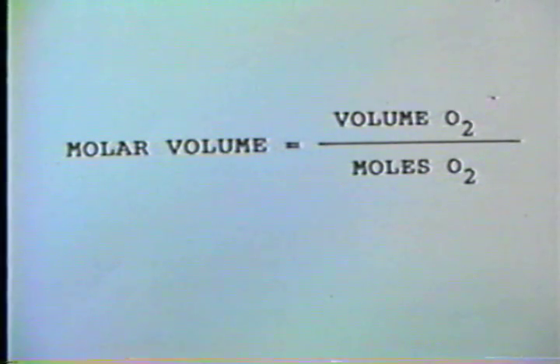Also, from your data which you've collected, you'll be able to calculate the purity of the potassium chlorate you used. Well, at this point, I think you should start the experiment.